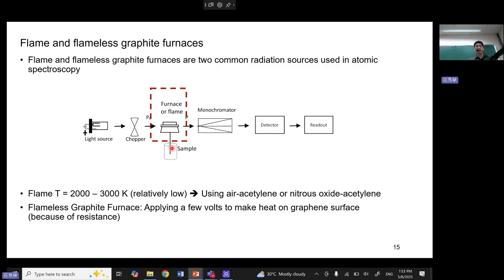And in the central part, you have the energy source. The energy source here is, as I said, where the key reaction happens. By controlling the right temperature, you can obtain the maximum amount of the element in the desired state.